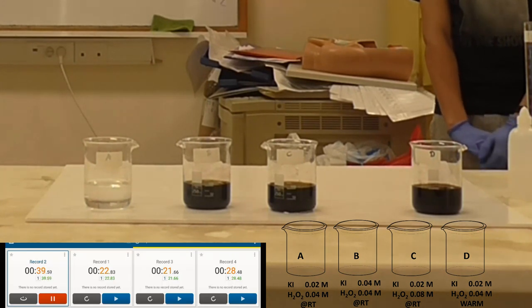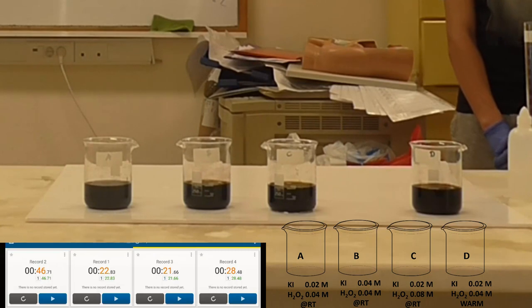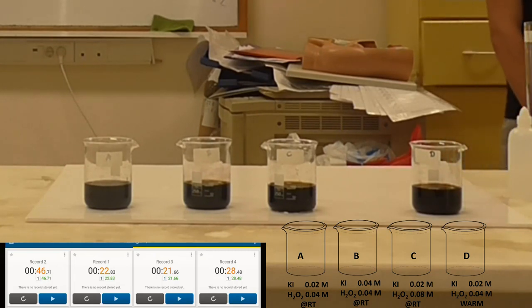Reaction proceeds in all four beakers, albeit at a different speed. Higher reactant concentrations increase the number of molecule collisions per unit of time and therefore increase reaction rate.